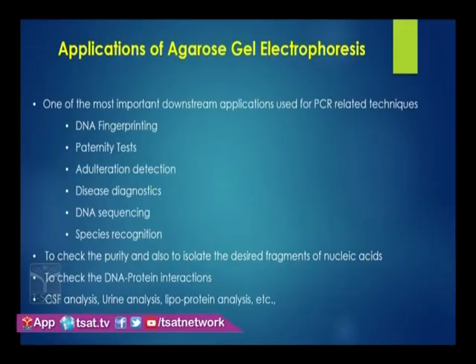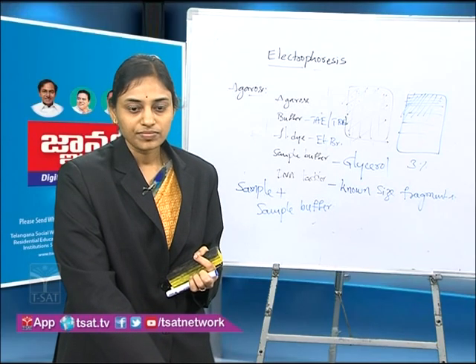And this could also be used to analyze the DNA protein interactions. Once the protein binds with the DNA, its molecular mass would increase and it would migrate slower than the normal DNA molecule.